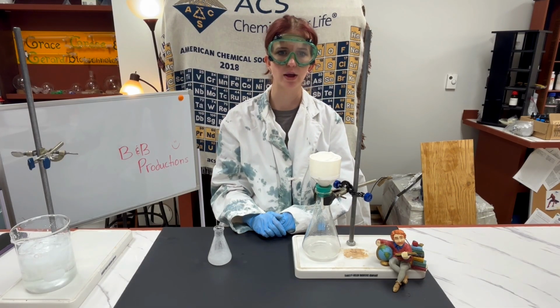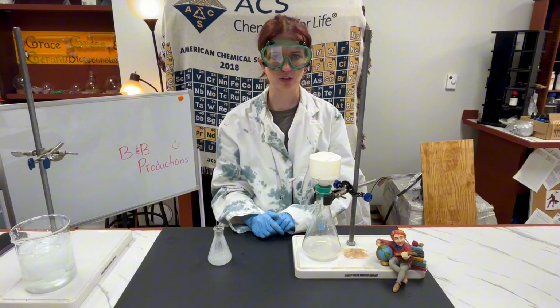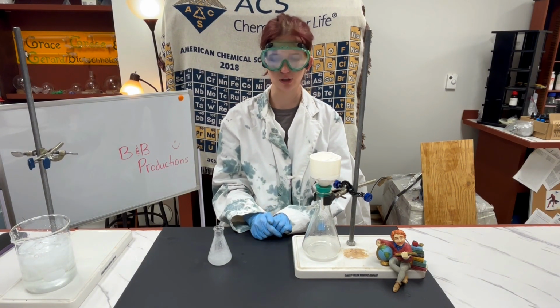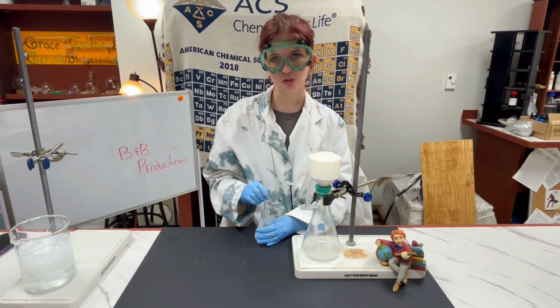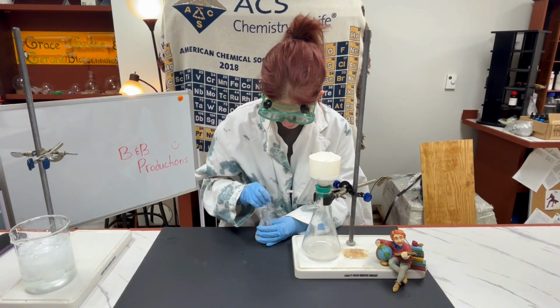Make sure to pre-weigh your filter paper. If you need a reminder on vacuum filtration, visit our video that will take you step by step on the setup and procedure. Your crystals should look something like this. If your crystals are too large, make sure to break them up gently with a glass stir rod.